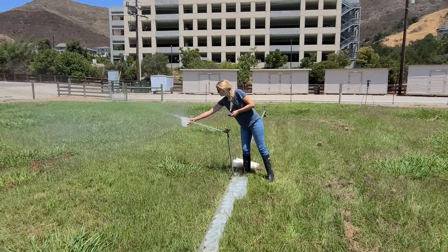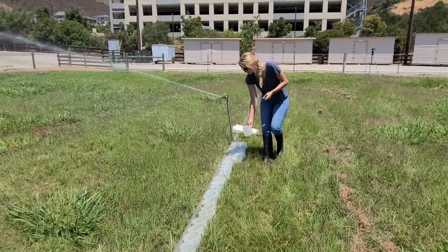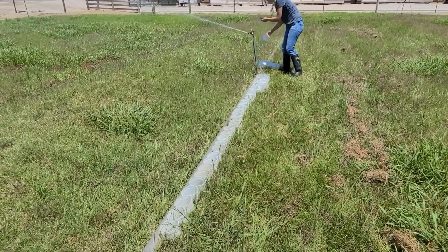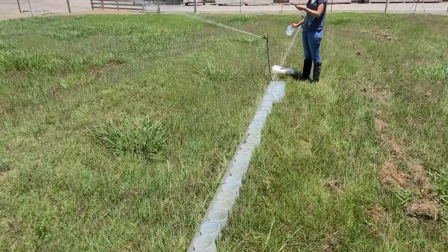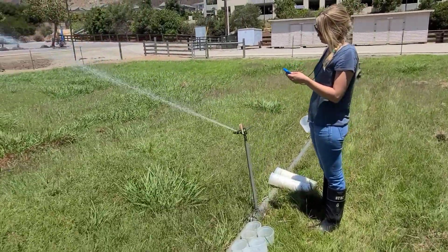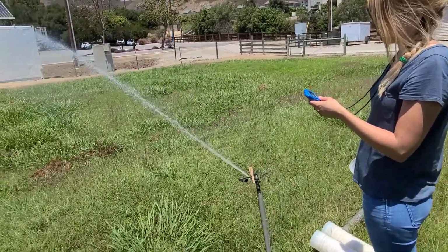So here's an example from the first sprinkler on the line. What you can see is that every 30 seconds she's collecting a water sample and then lining it up along the pipeline there so they're kept in order. We will use these to determine what the pH is as time goes on, and then we will plot that up for you.